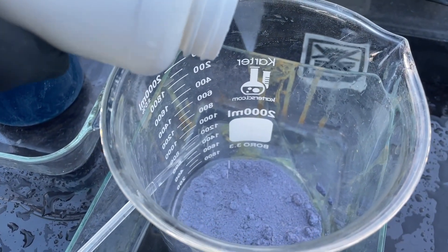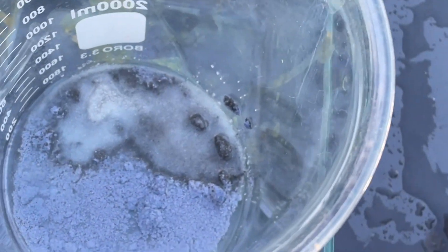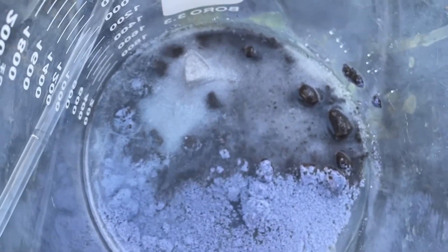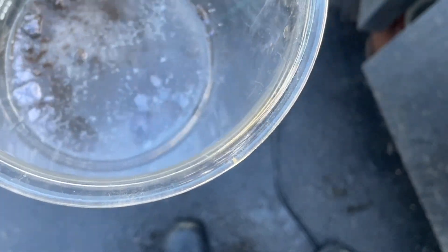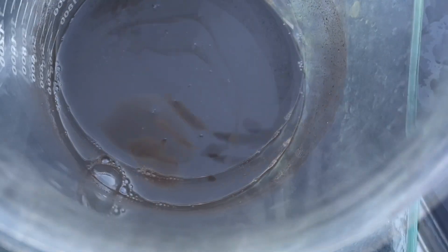Watch the reaction — there you go. Look how black it turns immediately. It's oxidizing the heck out of that silver chloride. That quick — look at that — just about got her there. That's gonna be just enough; it looks pretty black to me.